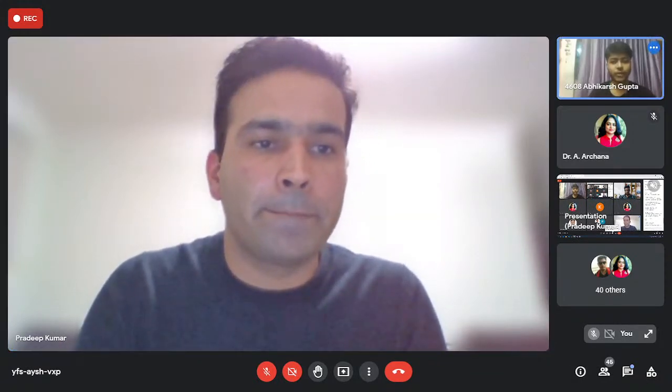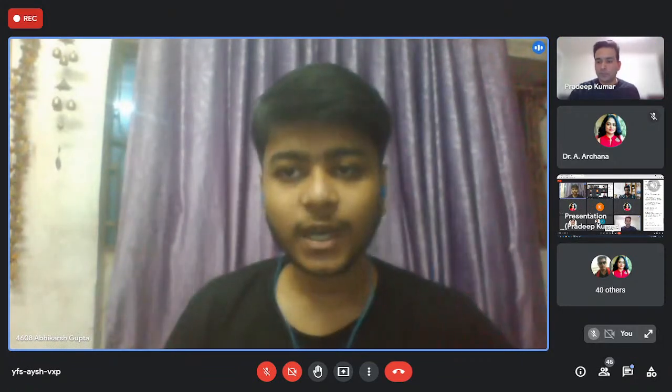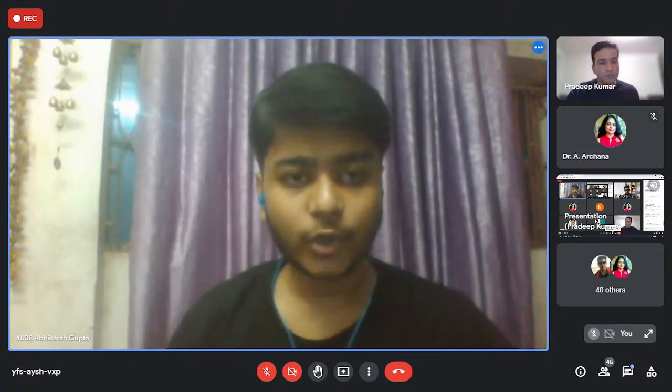All right, sir, thank you. So now I think this is the last question for the day. Pulkit asks, sir, what are the parameters considered for choosing fluorescent compounds for labeling antibodies?